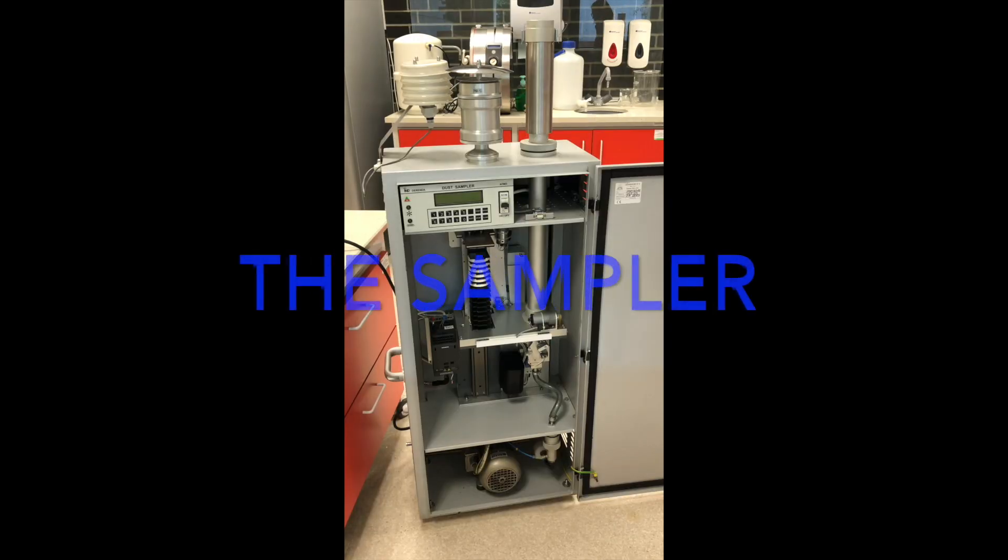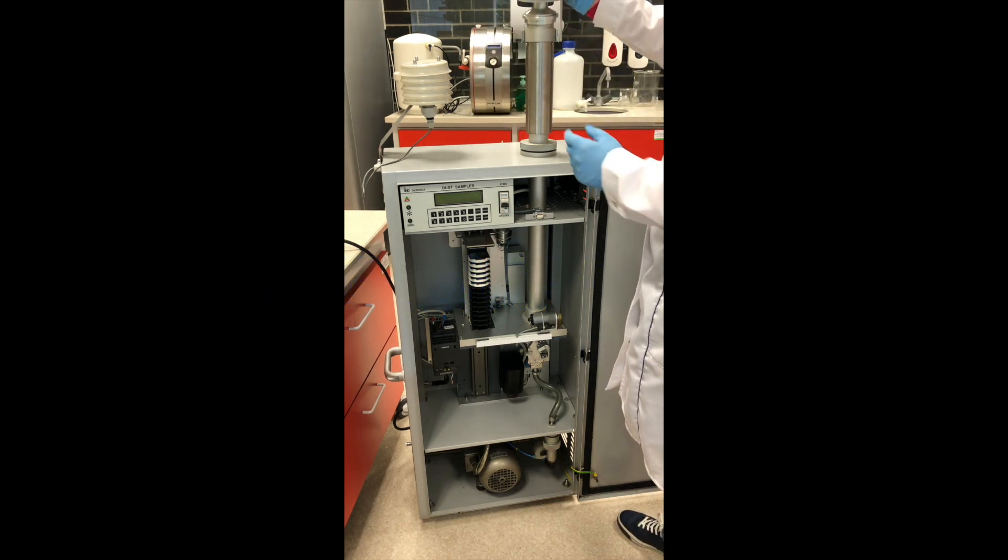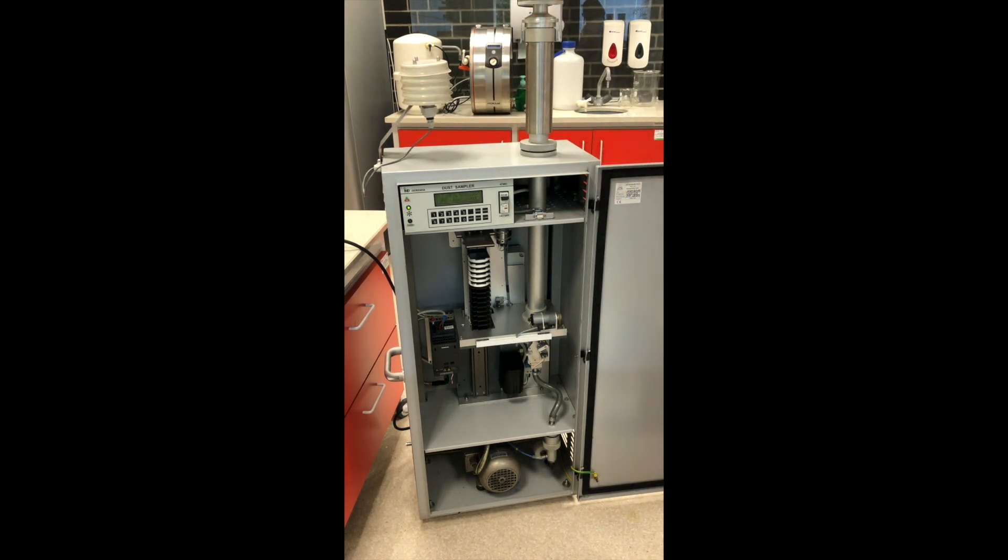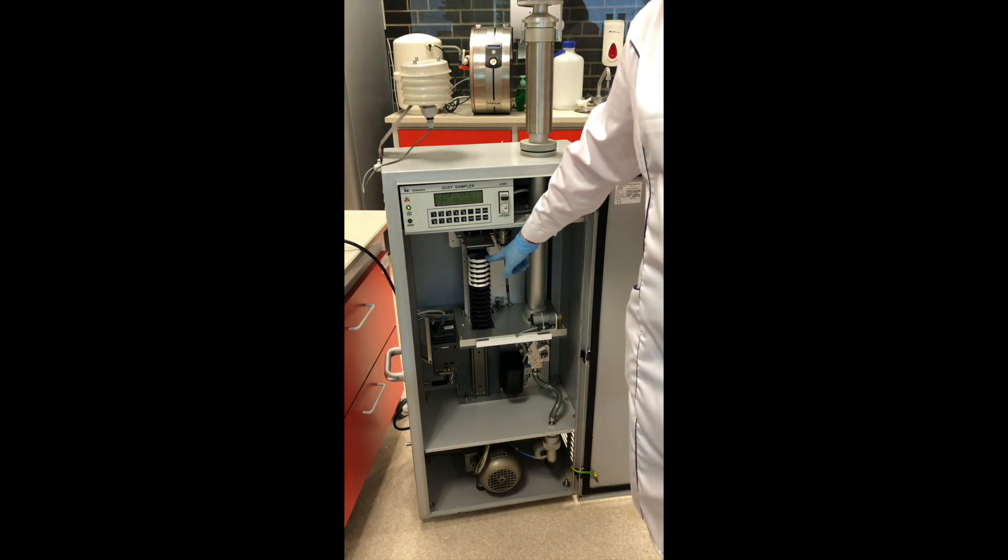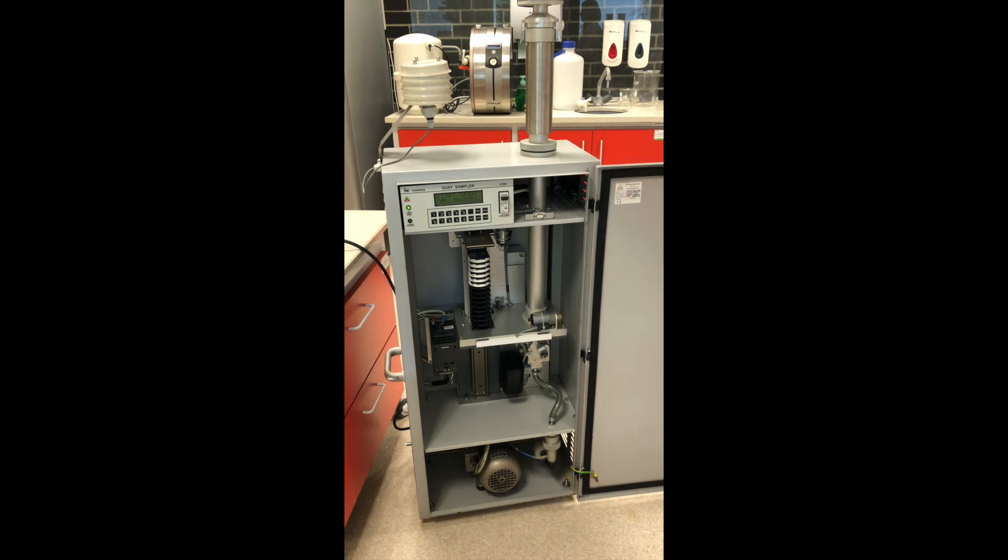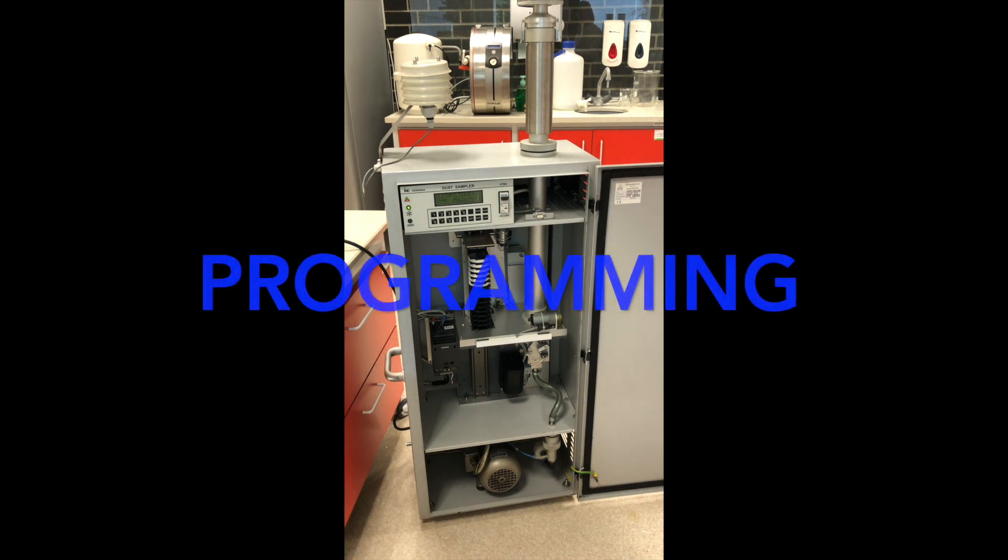Here is how the sampler looks like. We have our measuring heads. We have to put it on the top and we turn on the sampler. In the time, we can change the cassette. We have filters here and then we have to program the use of the sampler.